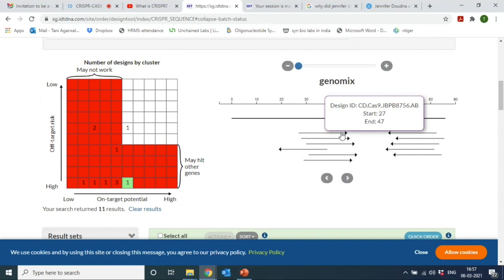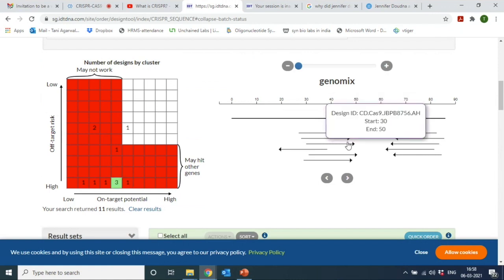As well as, if you look at the grid right now, there is one number, one box, which is highlighted in green. So basically, this is the identification, or what I should say, the activity score. On the grid, it is highlighted here. Now, if I go to any other sequence, others are highlighted.